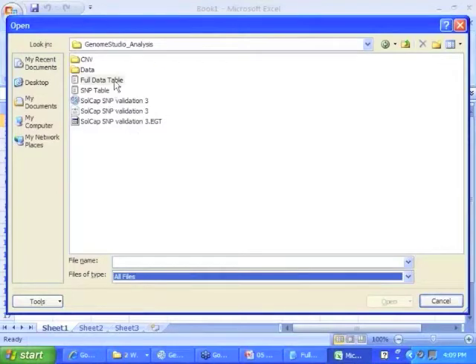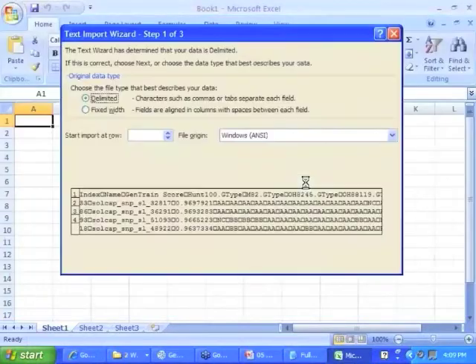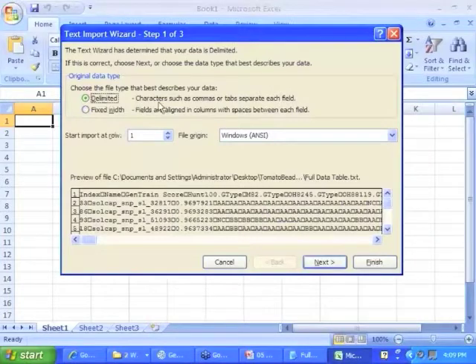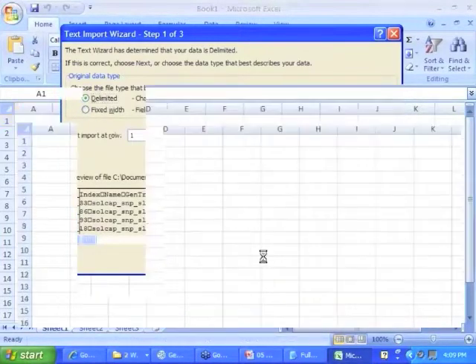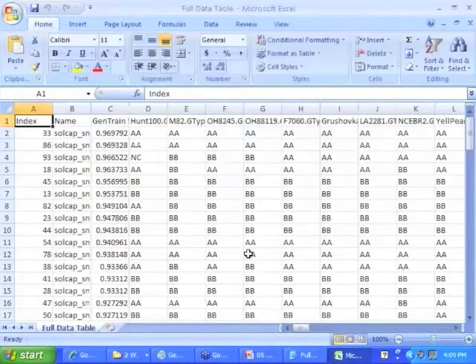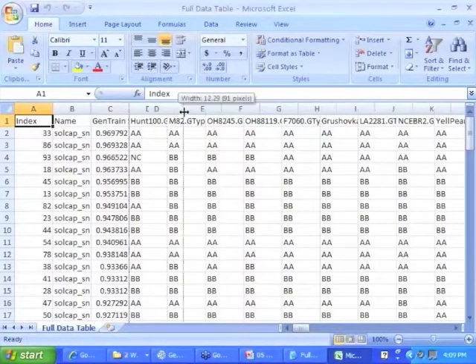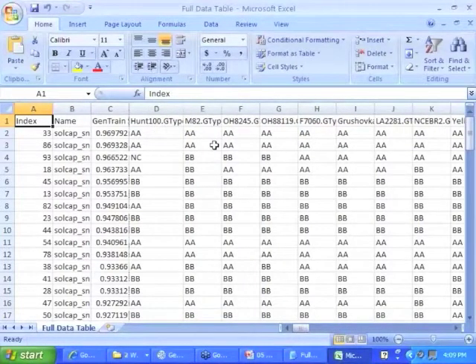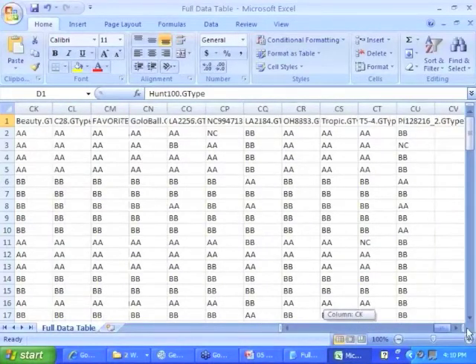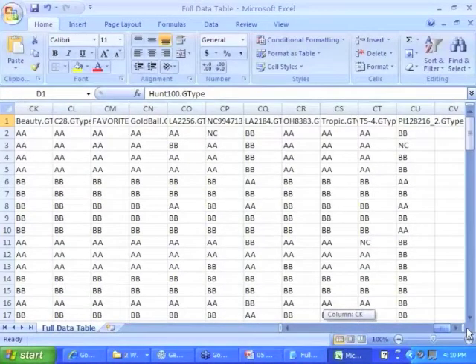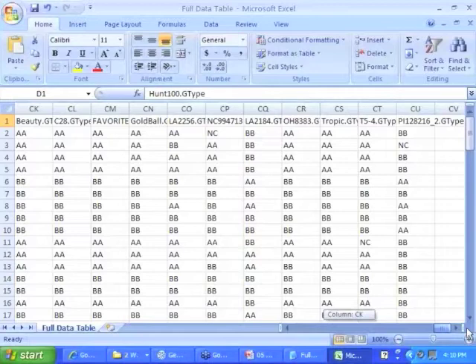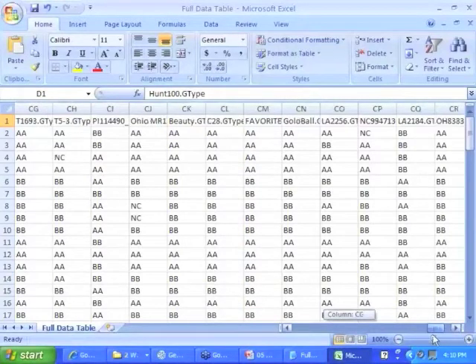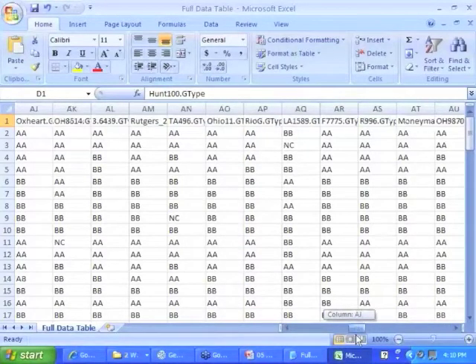The full data table, I'm going to open that in Excel. And I'm going to go, tab delimited, finish, and there it is. So here's my sample. There's the genotypes, and basically you can upload that to your database and include that in with your phenotype data and move forward. So there's your genotypes on that.